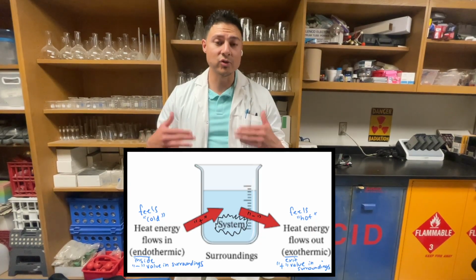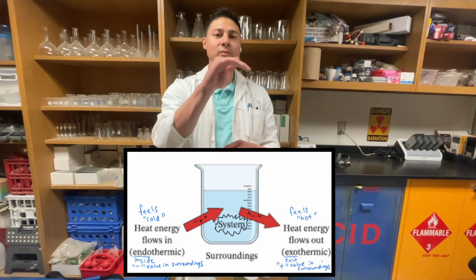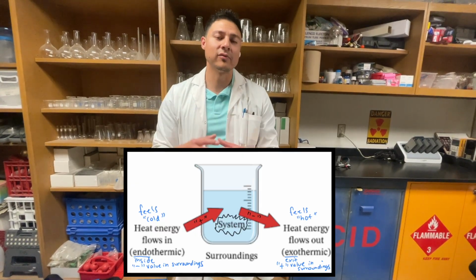The temperature is going to be dropping. Okay, you're going to end up with a negative value because that heat energy is being lost from the surroundings. It's going to be absorbed into the system. So therefore, the system is receiving all that energy, and it's a positive value for the system. So keep those in mind.